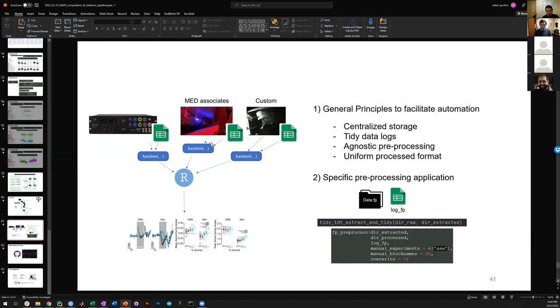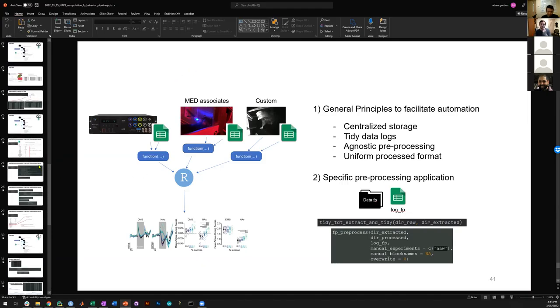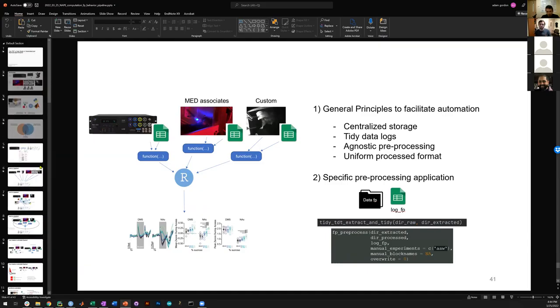Yeah, Adam, great talk. I feel like I asked you this before, but I'm forgetting what you said. In the beginning, when I was learning how to analyze my data, I made the mistake of bringing the full data from TDT into R, and that completely crashed R because it was trying to compute gigantic amounts of data and the memory just couldn't handle it. Is that ever going to be an issue? I know you use the feather format, but if you're using MATLAB, I looked up whether you can easily put it in a feather format, but I don't think that's readily available.